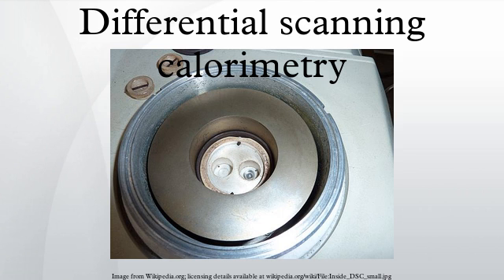Oxidative stability. Using differential scanning calorimetry to study the stability to oxidation of samples generally requires an airtight sample chamber. Usually, such tests are done isothermally by changing the atmosphere of the sample. First, the sample is brought to the desired test temperature under an inert atmosphere, usually nitrogen. Then, oxygen is added to the system. Any oxidation that occurs is observed as a deviation in the baseline. Such analysis can be used to determine the stability and optimum storage conditions for a material or compound.